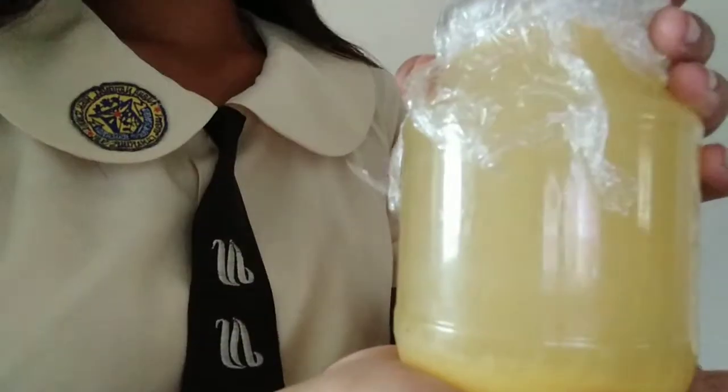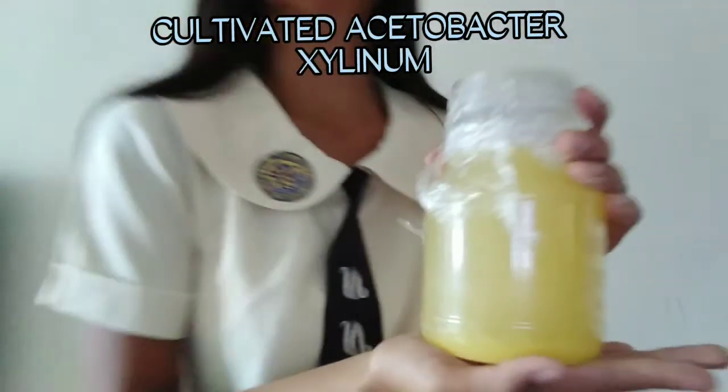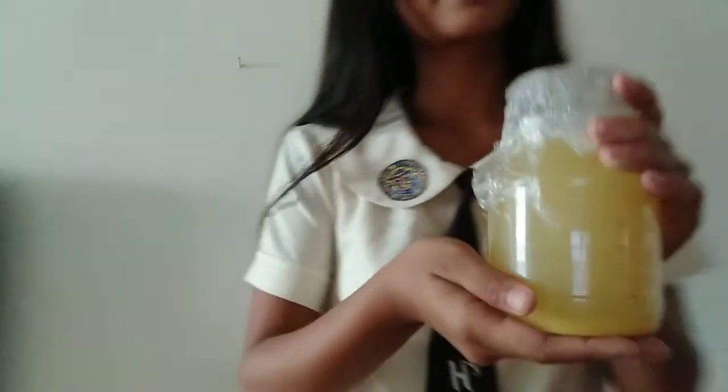Hi everyone, I'm back again! Today is the 7th or 8th day of the cultivated Acetobacter we made. I said in the first video we would cultivate it for 7 days, but in the procedure it can be 7 to 10 days, so this video is for 8 days. I'm going to show now the cultivated Acetobacter xylinum. As you can see from the very first video, it was yellow, and now it is light yellow. This is now cultivated for 8 days.